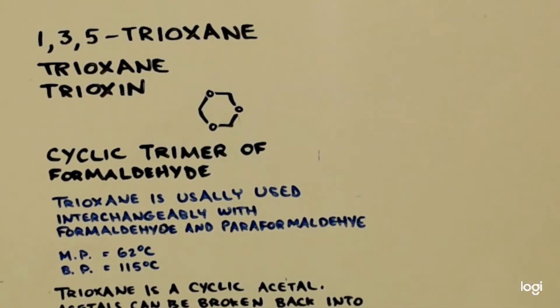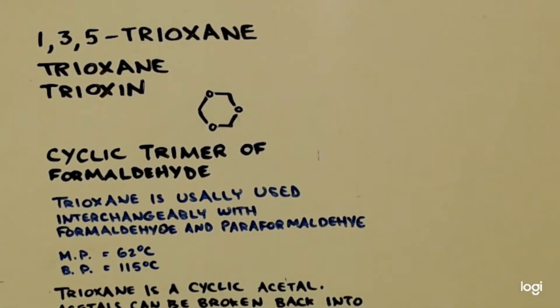Trioxane is usually used interchangeably with formaldehyde and paraformaldehyde. It has a melting point of 62 and a boiling point of 115. And that's why we didn't use a water cold condenser, because it solidifies so easily. You want to have a heat gun like this, an industrial heat gun that gets real hot.